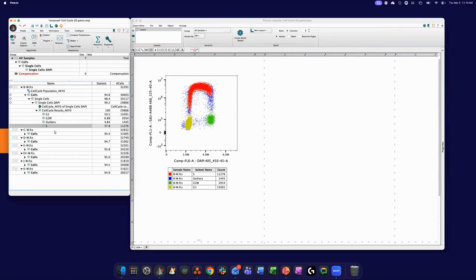All right, I do see something in the chat. Let me pop over again. I tried this plugin for my 2D analysis. It didn't work and gave me an error to contact the technical team. Okay, Hadika, that's a good question. It's hard to say when I can't see what the issue was. So if you want to send me an email, which I'm going to pop up here in a moment, you can perhaps share the data and maybe a screenshot of your workspace setup, and we can run it on our end and see what the issue is.